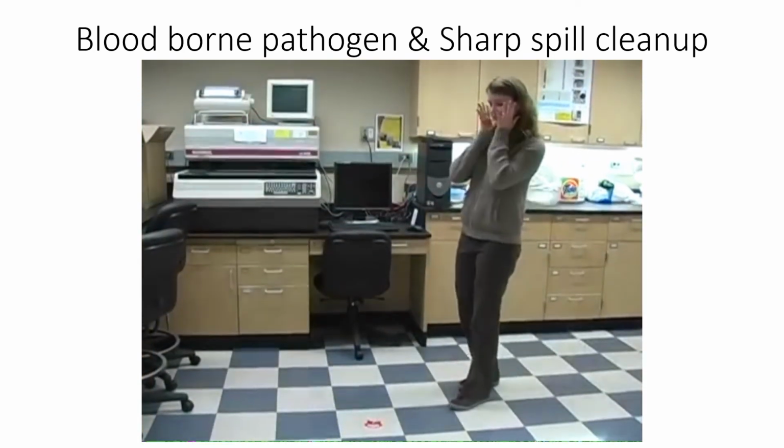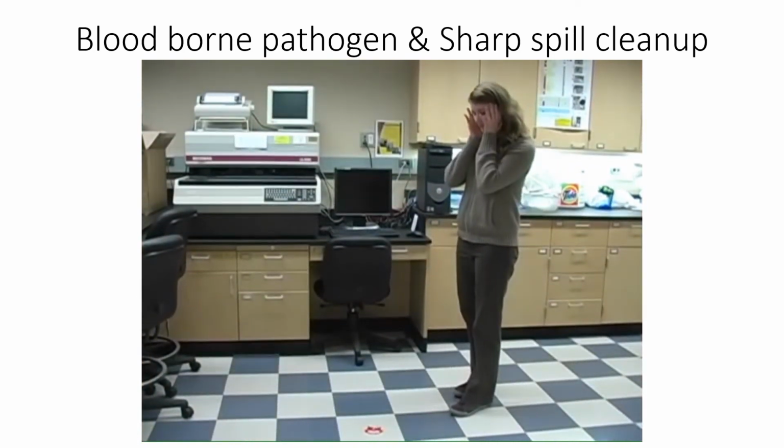The first step is to stop and survey the area of the spill. What are you dealing with? Is there anyone seriously injured? Is there blood or other material that might harm you? If someone is injured, he or she is your first priority.